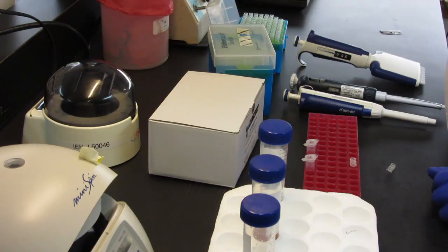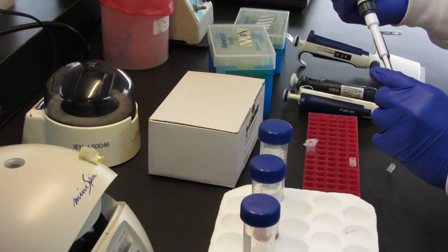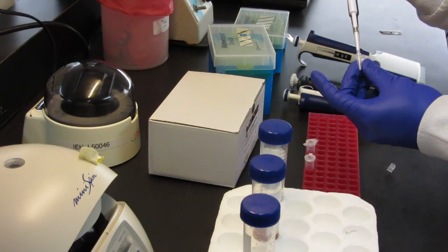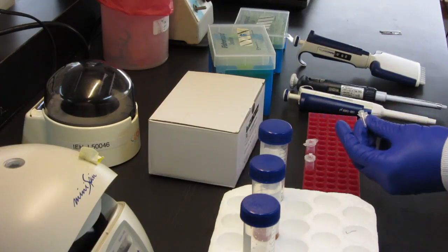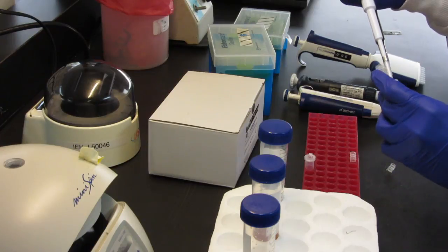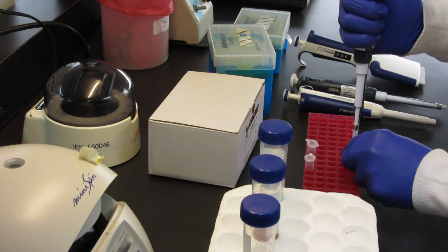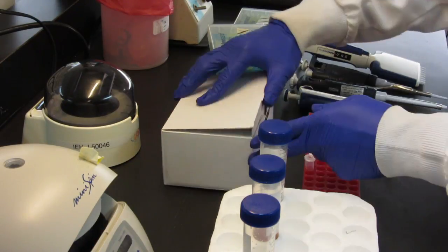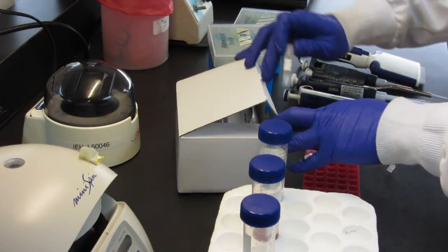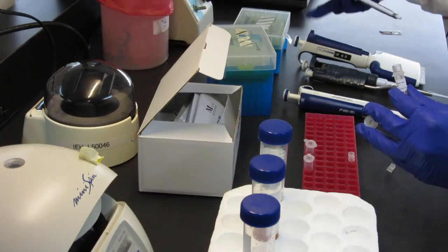Take 2 microliters of the sample you just suspended in the water and dispense it into a 0.2 milliliter PCR tube. You will then want to transfer 50 microliters of PCR buffer and 2 microliters of lysis solution from the kit into each of the PCR sample tubes.